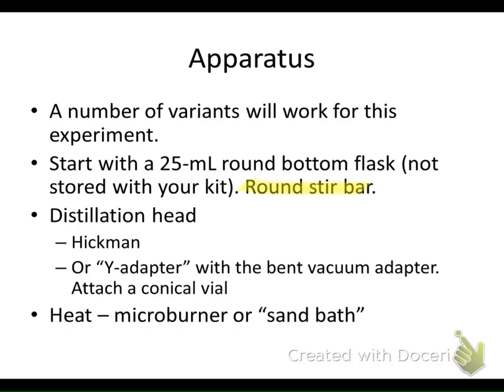Then on top of that, you'll add a distillation head. Now there's a couple of ways, and I'll show pictures of these in a second. You can use a Hickman distillation head. We've had problems with Hickmans in the past, but we don't actually have enough Y adapters, and there's no guarantee that the Y adapter will help us any more than the Hickman head will. But what happens in a Hickman head when there's bumping is typically it gets up into the trough at the top of the Hickman head, and I'll show that picture in just a second. But that gets up in that trough, and then you have a lot of solids that you have to separate out.